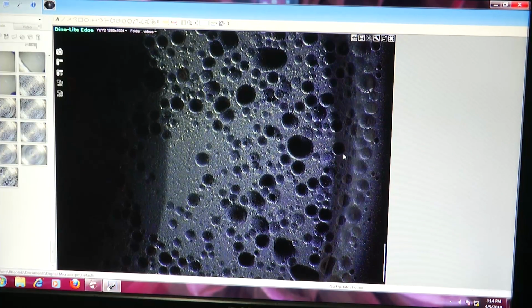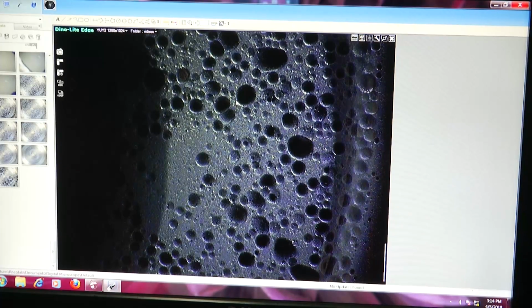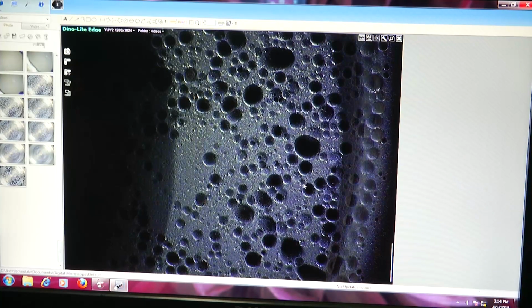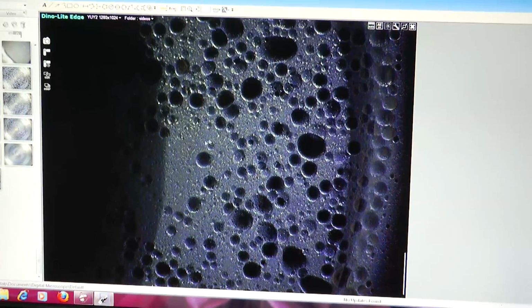Now I have loaded the sample, and this is how the sample looks like when we look at it through a microscope. And this is the image that the microscope attached to this rheometer is capturing right now, and this is how the sample looks like before starting the test. Now you should notice how the drops look like before starting the test. These dark black colored ones are the droplets of oil which is stabilized by silica, and this is the continuous phase.